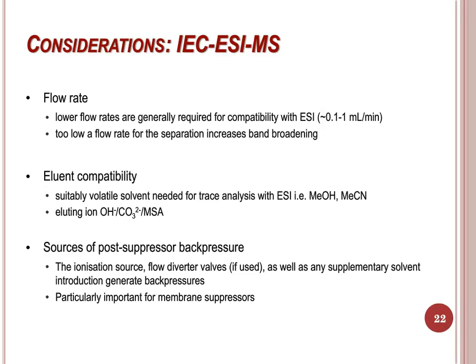Finally, sources of post-suppressor back pressure also need to be characterized carefully. The ionization source, flow diverter valves if used, as well as any supplementary solvent introduction, generate back pressures. High back pressures can be irreversibly damaging, and therefore it is important to keep within instrumental limits.